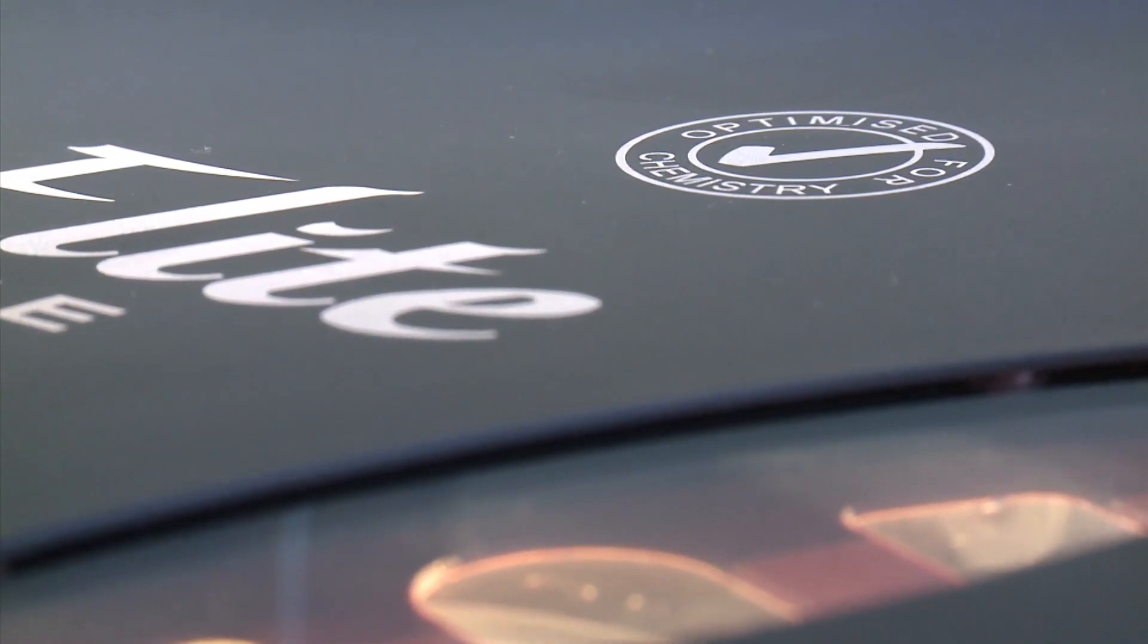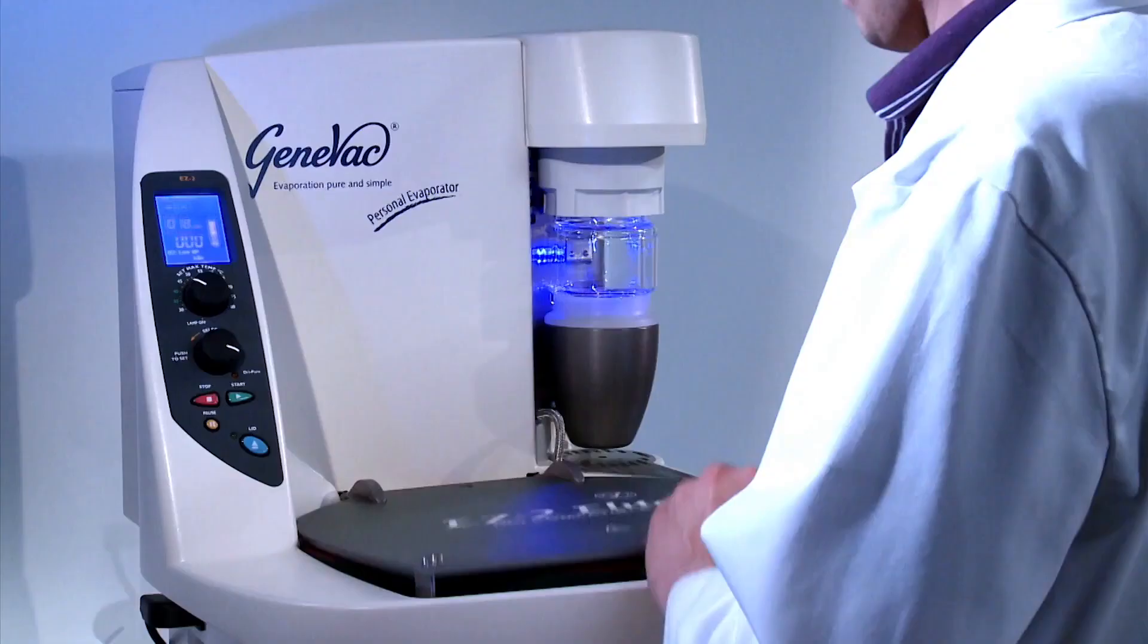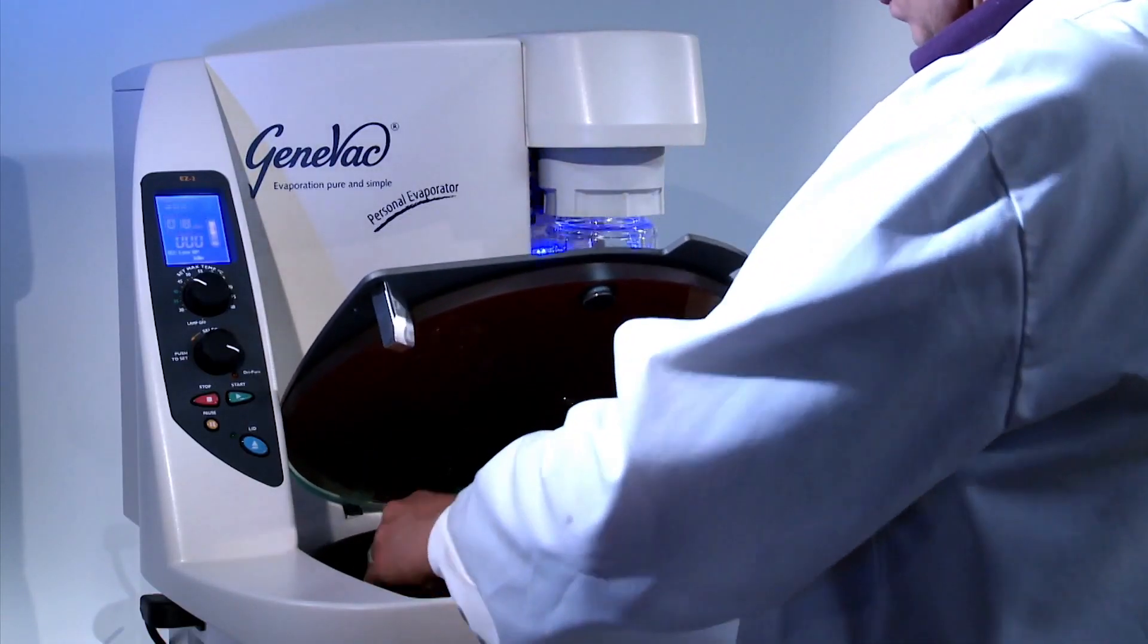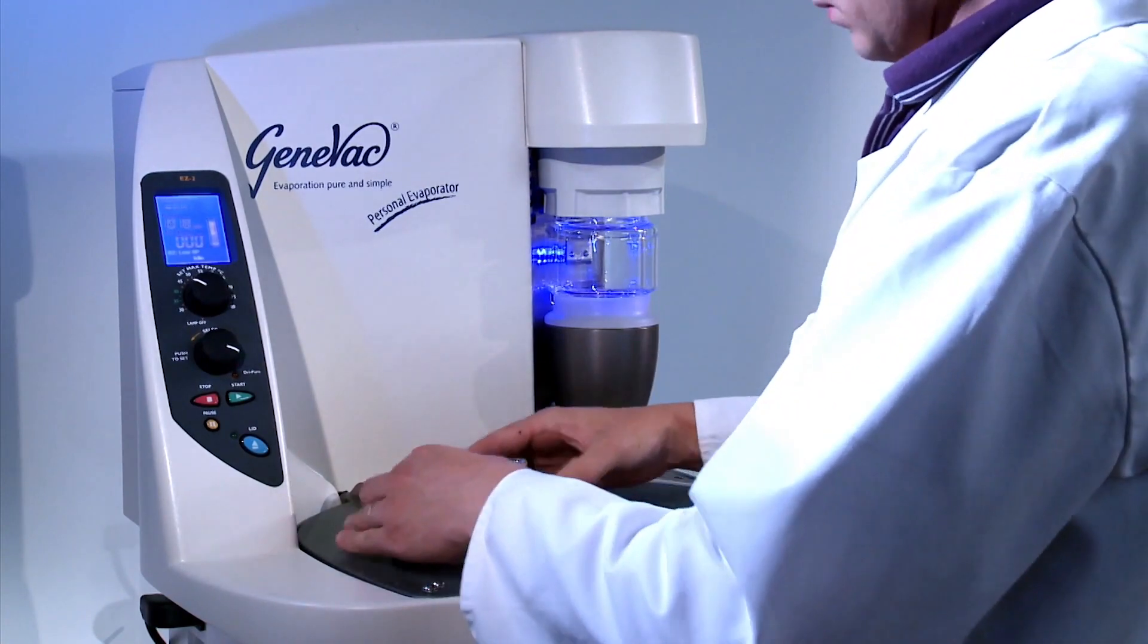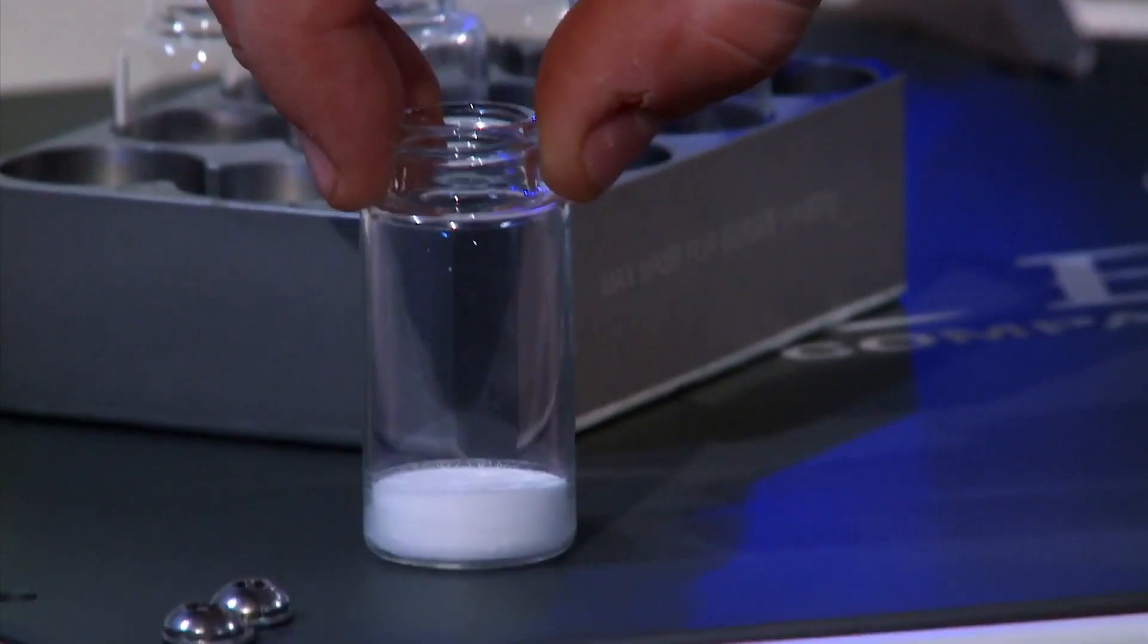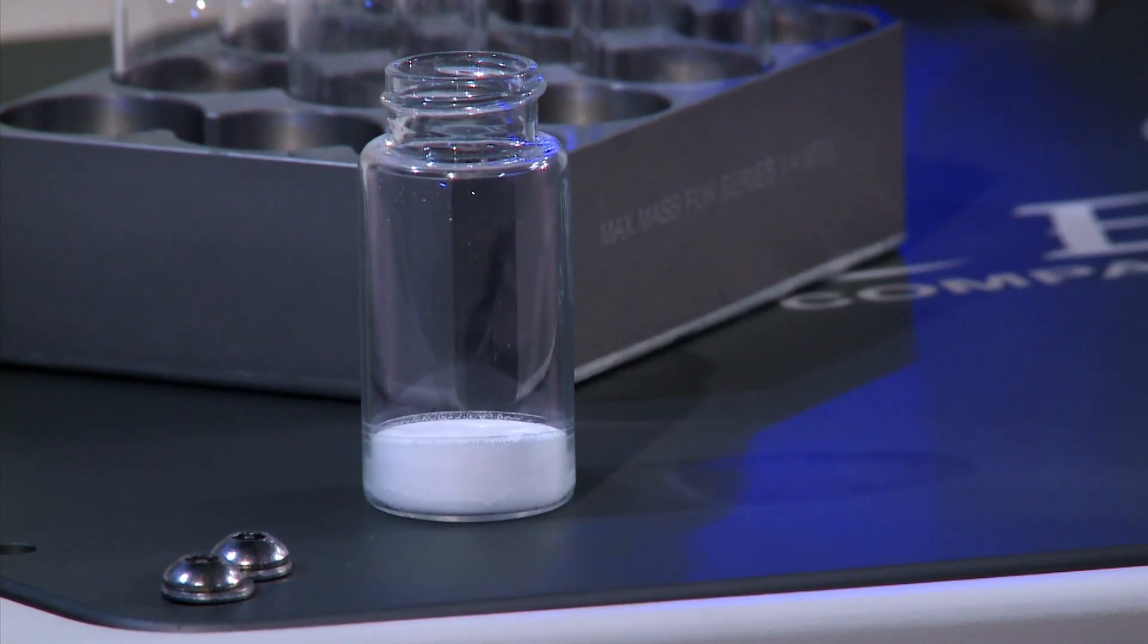The LIOSPEED method evaporates the volatile organic solvents in the HPLC fractions, then concentrates some of the water, only lyophilizing the last few milliliters. This is much faster than traditional freeze drying, and the EZ2 overcomes any risk of solvent bumping.